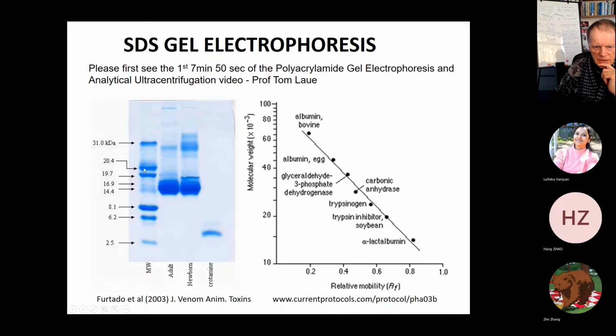And these are the sort of patterns that you get. And if you look at a biochemical, biological science, scientific journal and look and see some of the papers inside the journal, then there's a very good chance you'll see an example or examples of these types of what's called SDS-PAGE patterns illustrating protein structure, protein composition, and molecular weights.